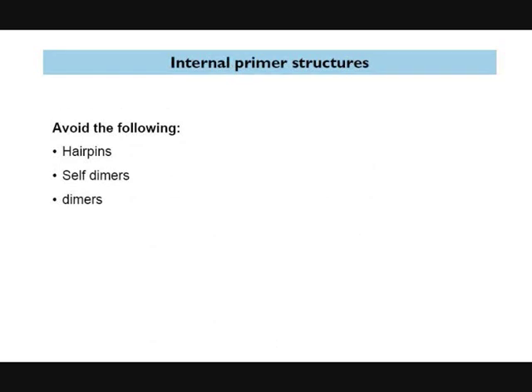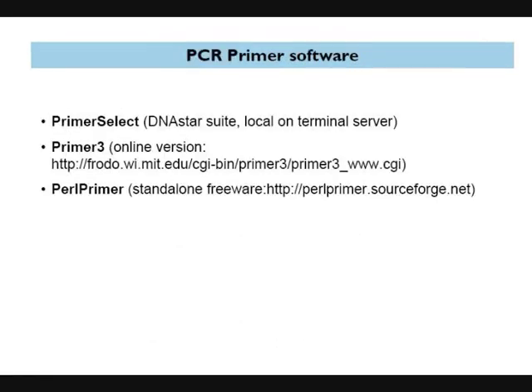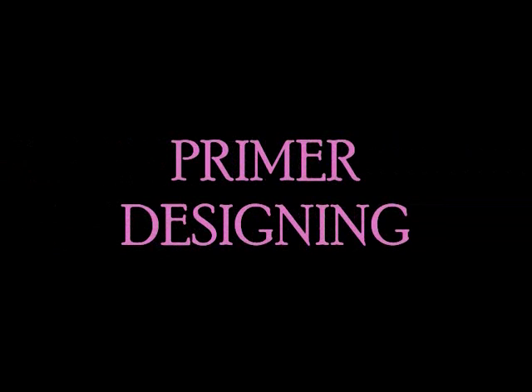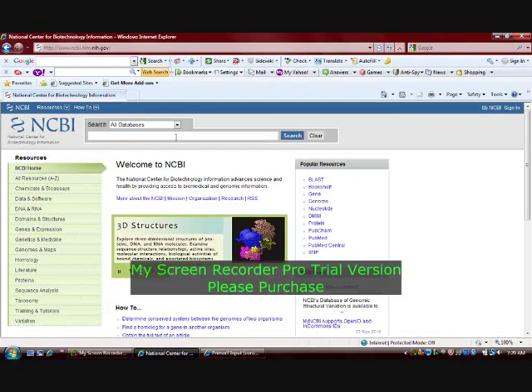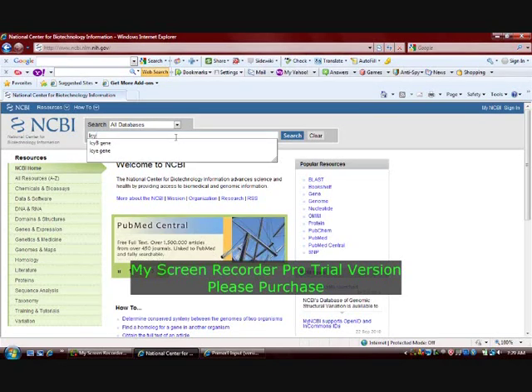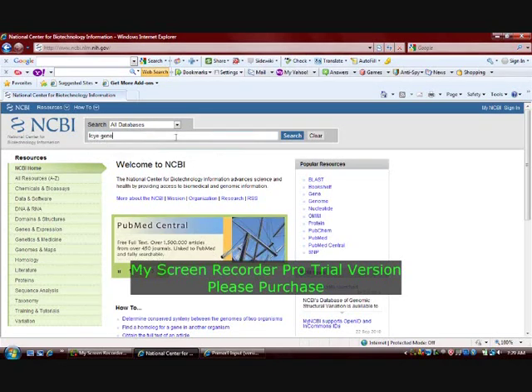The software used for designing primers includes Primer3, SelectPrimer, Oligo7, and PerlPrimer. Coming to primer designing: first, we need to retrieve a sequence, for which the NCBI page is opened and the LCYE gene is typed into the search text box. Then the nucleotide option is selected.